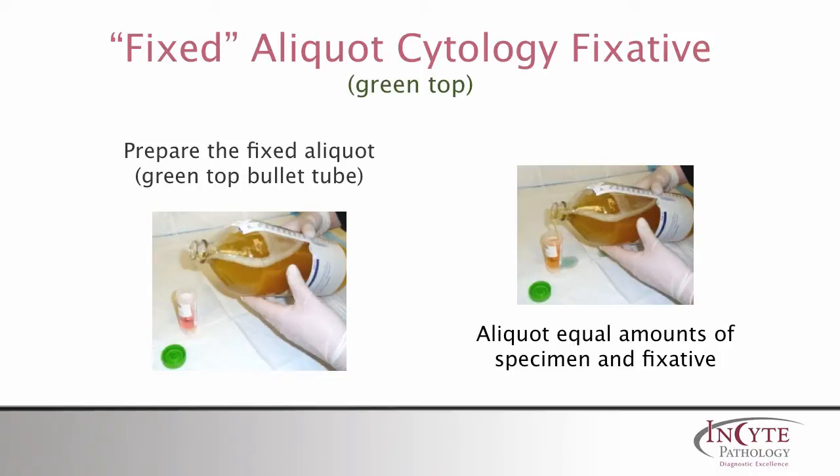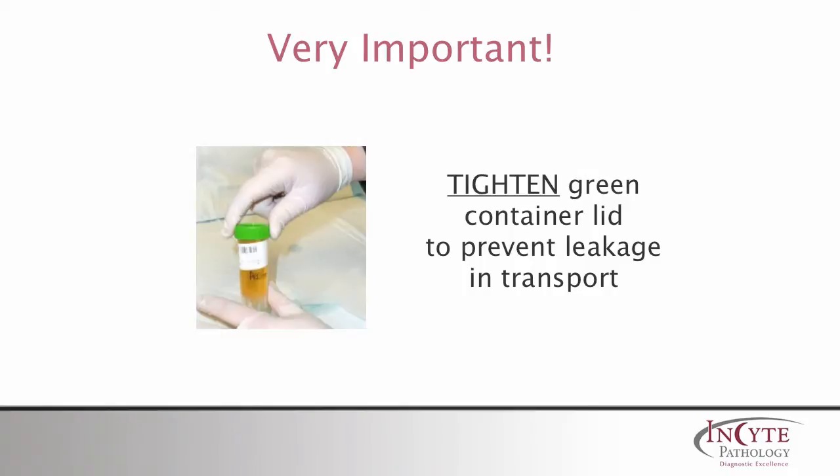Now prepare the fixed aliquot using the green top bullet tube. Be sure to aliquot equal amounts of specimen and fixative. Be sure to tighten the green container lid to prevent leakage during transport. Also check to make sure the patient label is not caught between the top and the container — even a tiny gap can result in leakage during transport.